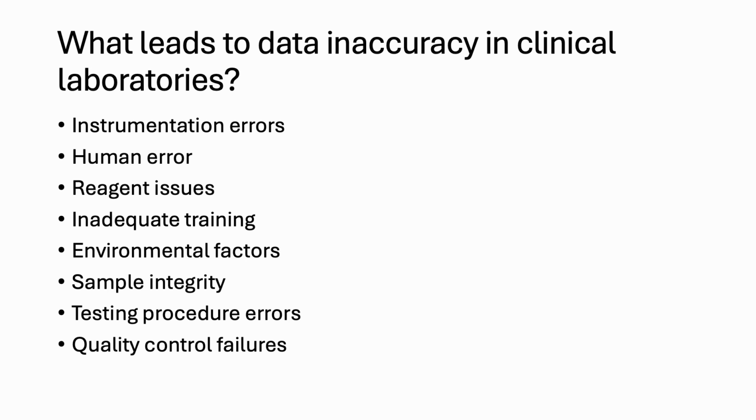Instrumentation errors. Faulty, uncalibrated, or improperly maintained equipment can produce inaccurate results. Human errors such as mislabeling specimens, incorrect data entry, or improper handling of samples can all contribute to the generation of unreliable data in a clinical setting.